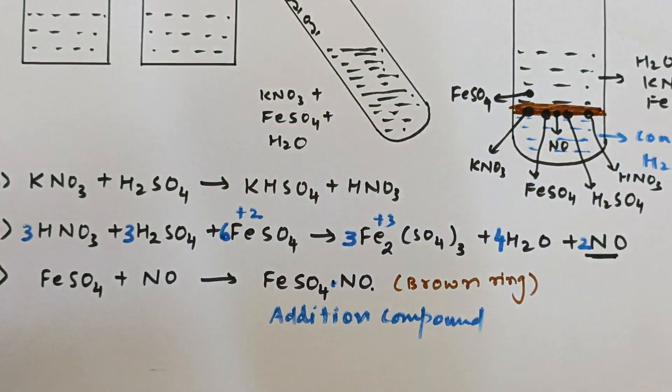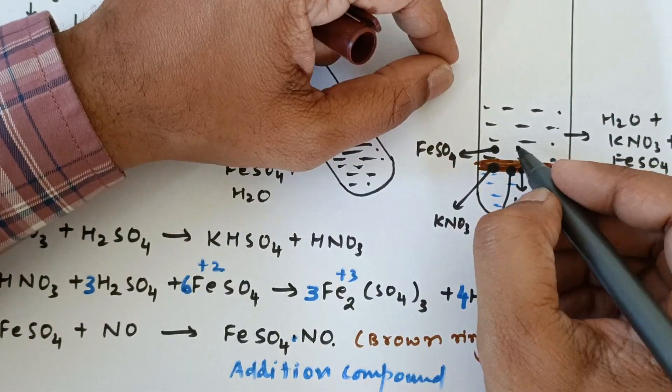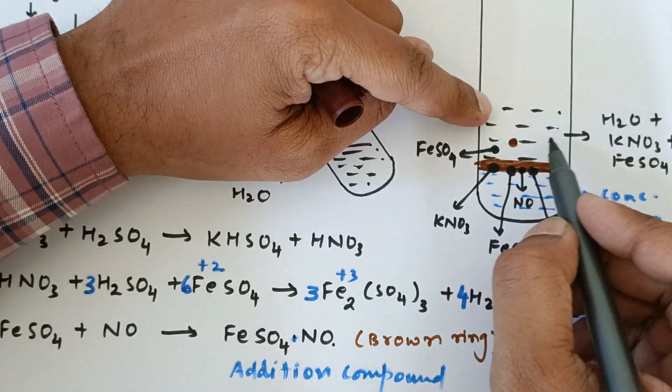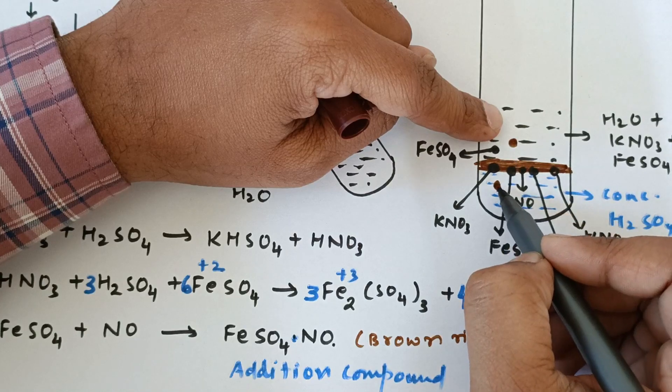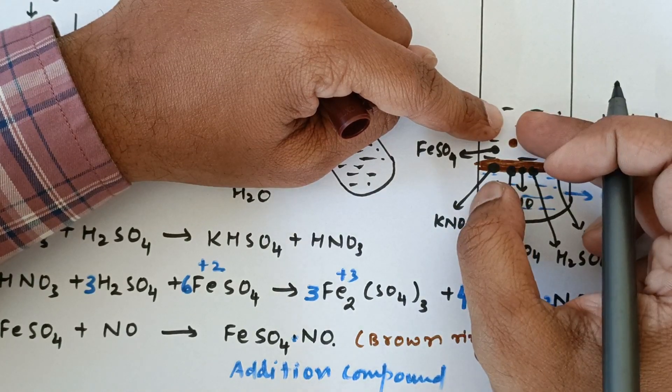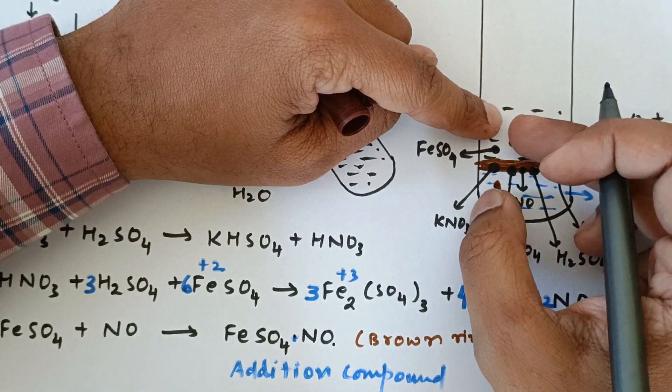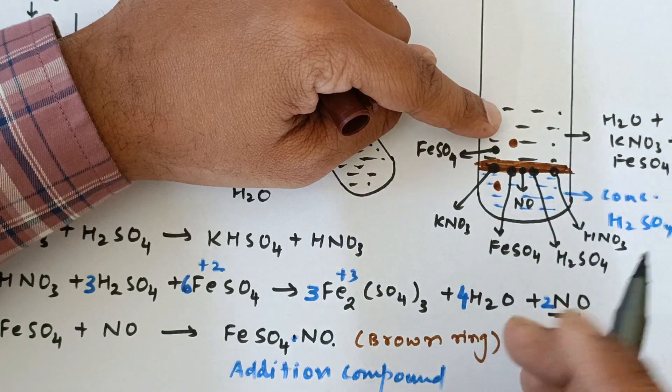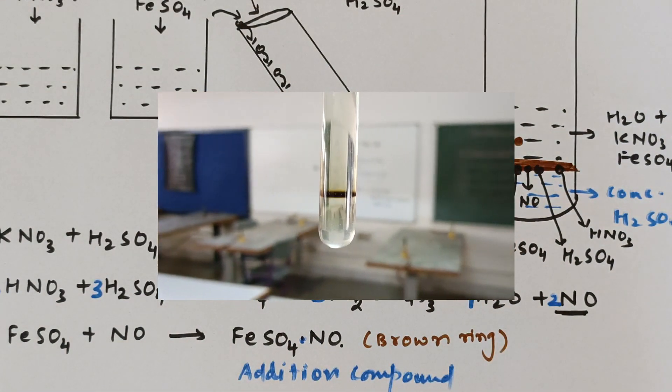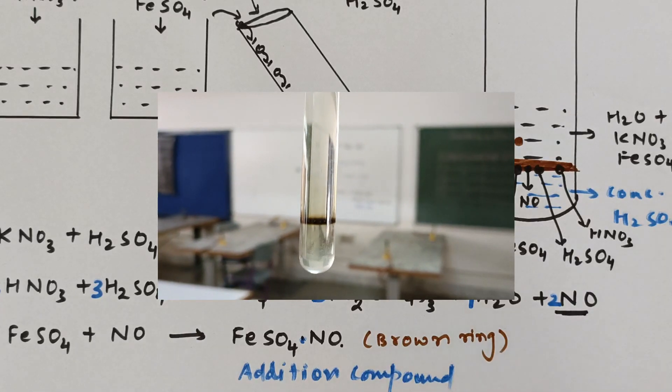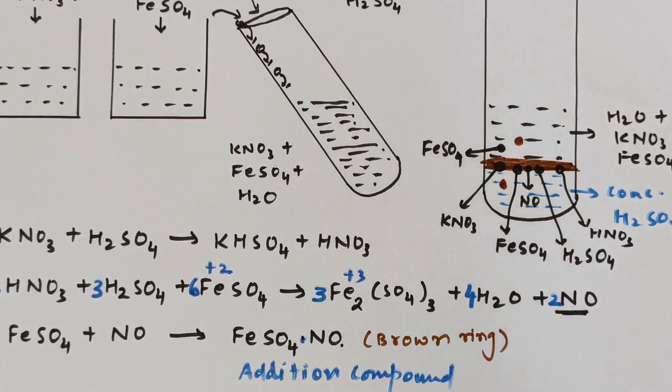Now you should also understand that even if you shake this entire solution a little bit, then the water molecules which are present here and the H2SO4 below this interface come in contact. Now that gives you a very highly exothermic reaction, and due to the enormous heat generated, this ring disappears. You are just seeing in the picture that I have got a beautiful ring and you can see it in the 3D view as well. Now if you shake it a little bit, this ring disappears.